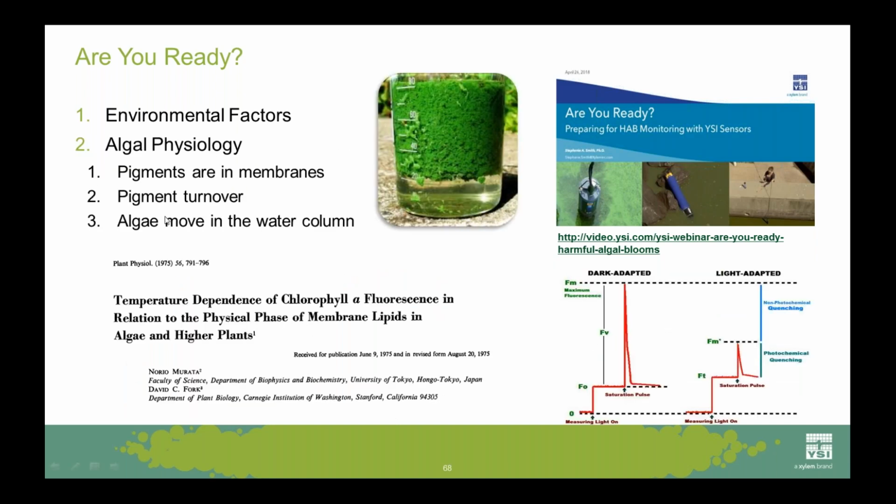Now, there are a lot of physiological examples, reasons rooted in the algae themselves, which can affect the reliability of laboratory units in an environmental monitoring context. This is especially true for those of you that still want to use cells per mL. The EXO sonde does not deliver cells per mL. This is why: it's not something we can really build a great correlation on. We did build something into the software that allows you to do it, but frankly speaking, I don't advise it.